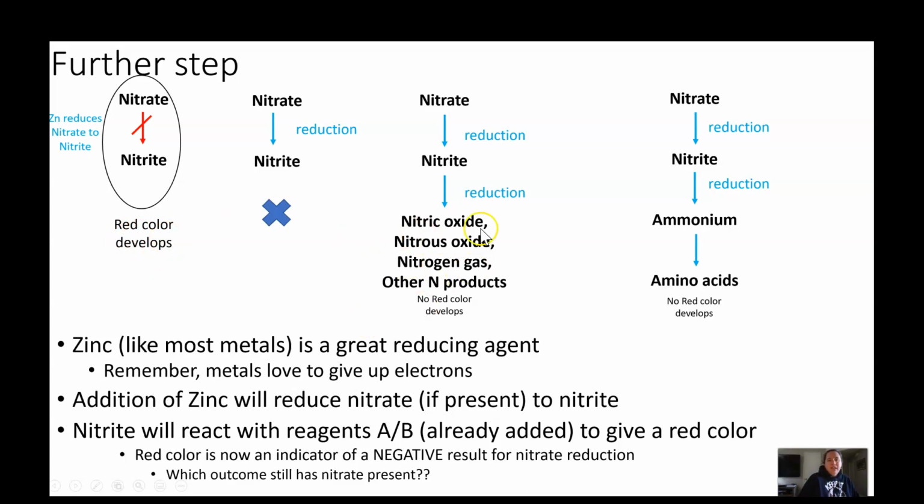So in this step, in this one, we don't have any nitrate in the broth. So adding zinc isn't going to do anything, and we're not going to get a red color develop.